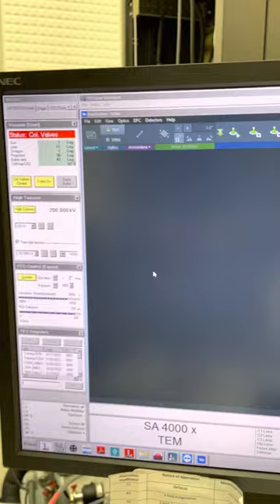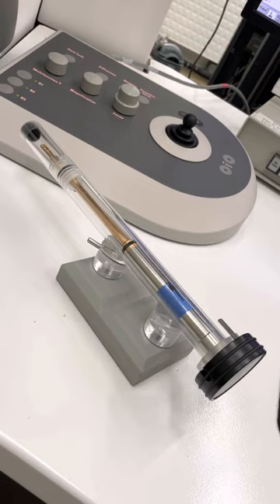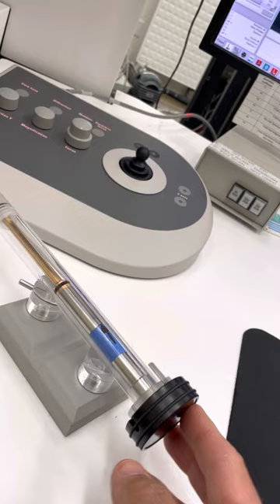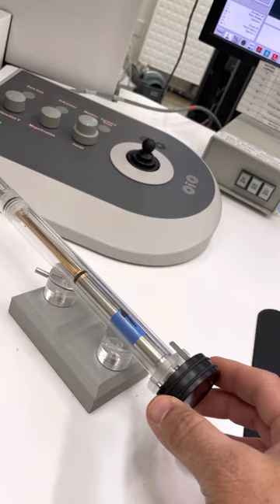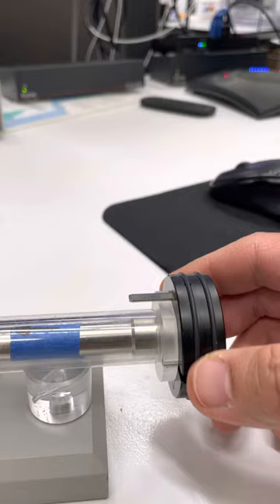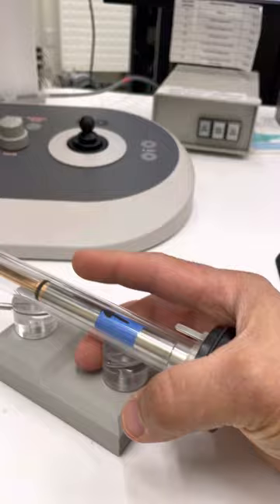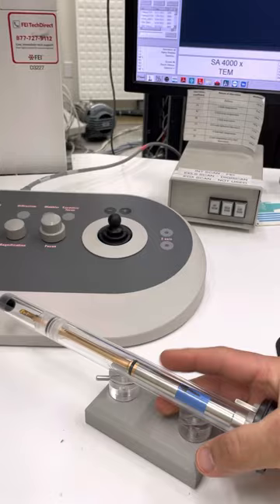So now we are able to insert the specimen holder. Always handle the specimen holder using this acrylic holder support. When holding this, always hold the back of the holder because this is loose. There is a little pin here that locks the holder, but the holder is somehow loosening in this direction. So always grab the holder like this, like a gun trigger. You better use two hands.